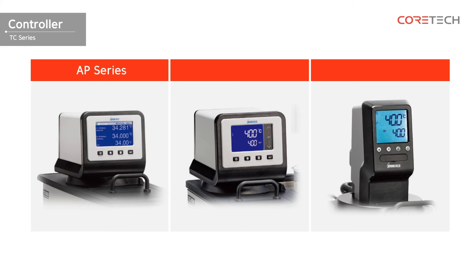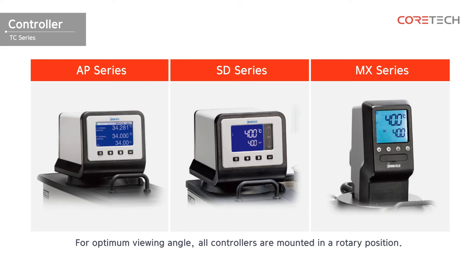There are AP series, SD series, and MX series. All controllers are rotated so that they can be repositioned for different viewing angles.